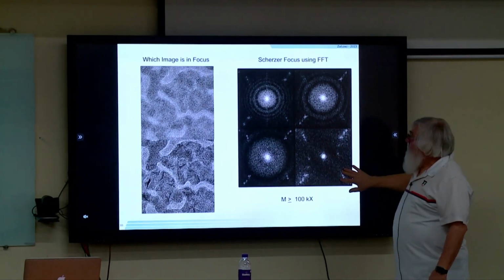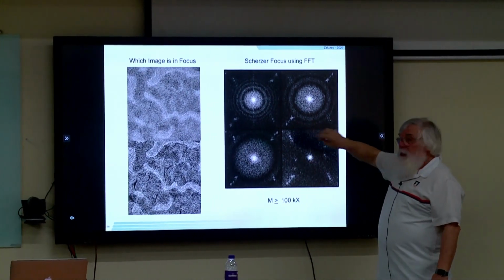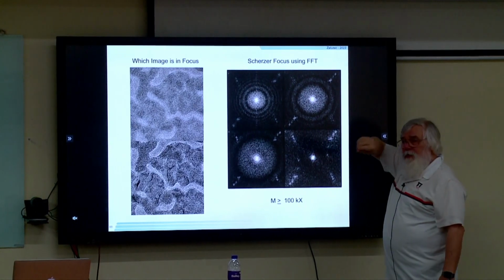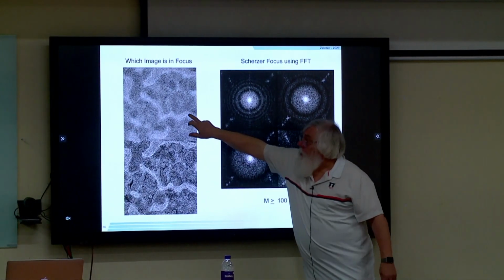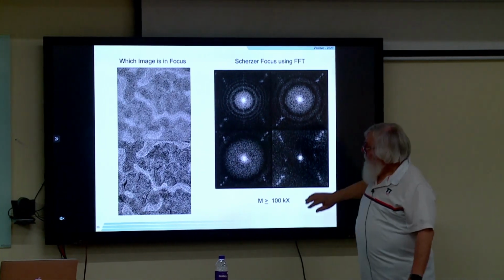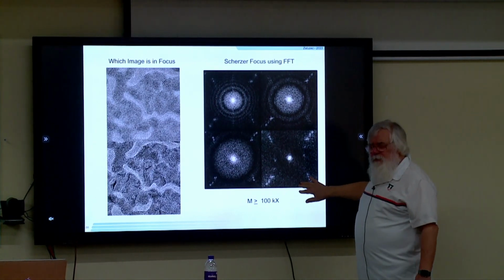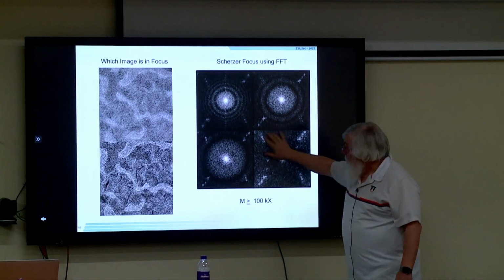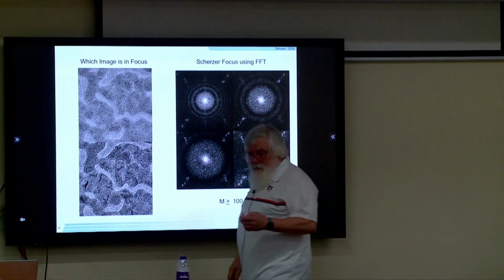And if you continue, the rings will start collapsing again. So you'll actually see the rings appear and decrease. And at focus, which is that image, I should have reversed the two, you don't see the rings, and it'll be a washed out Fourier transform.